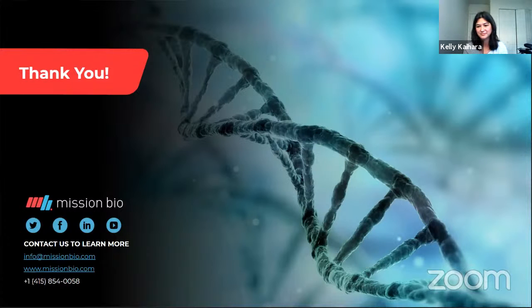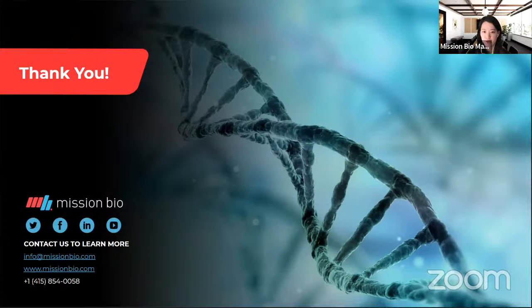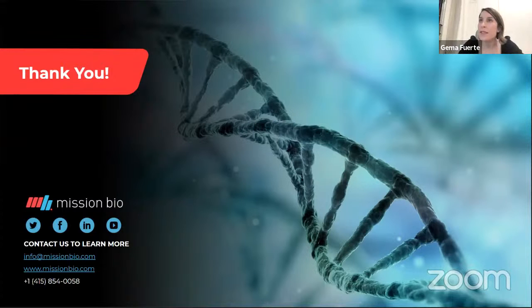Great, thank you. I have another question here. Is the DNA plus protein workflow compatible with fixed cells and intracellular protein staining? So it looks like a question about sample type. Yeah, fixed cells has not yet been tested, and intracellular protein staining is development work. So we have not tested these. Fixed cells has been tested and validated for DNA only, not yet for DNA plus protein. And we're working on the intracellular protein staining, but we don't know when this will be ready.